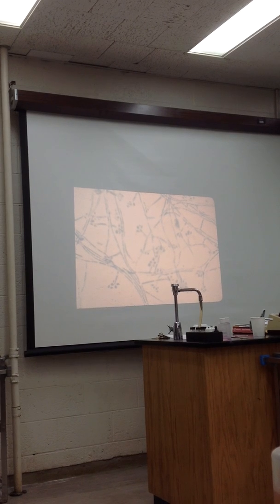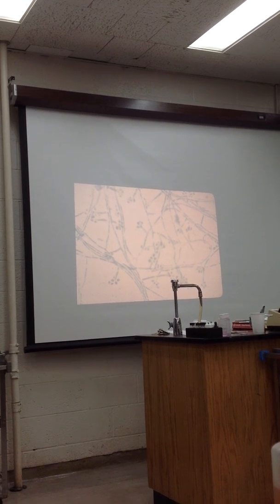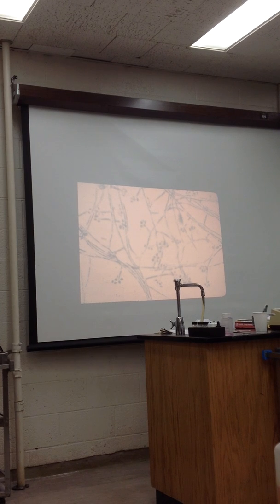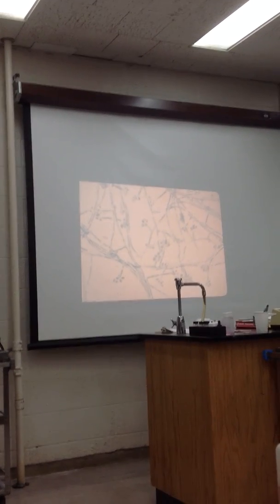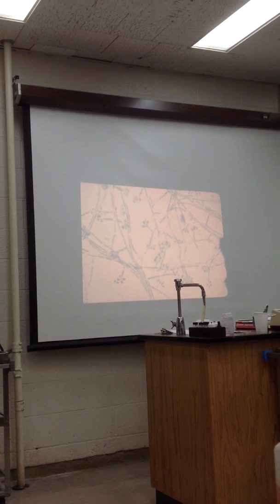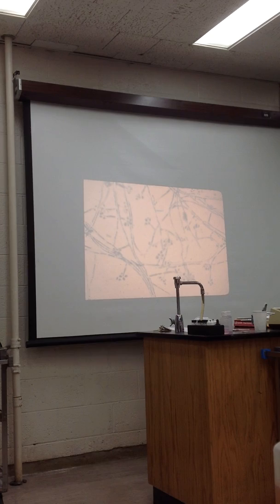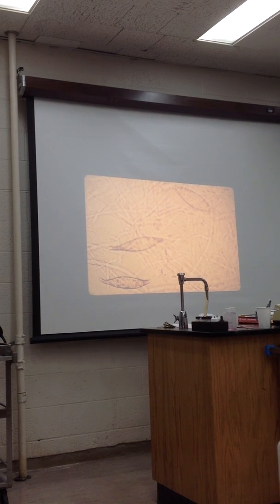In other words, here you have a fungus, and I think this organism is Sporothrix schenckii. And the disease it causes is rose thorn disease, a subcutaneous mycosis. Is this a dimorphic fungus? Yes. Sporothrix schenckii.